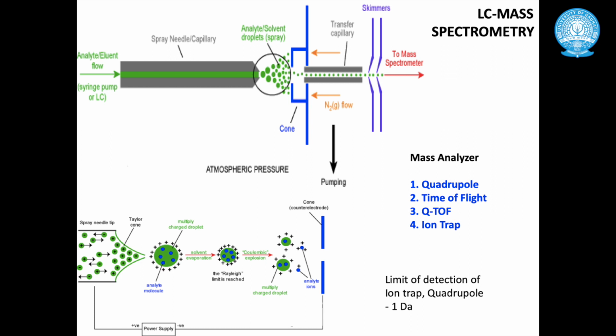However, after ionization, when the droplets break, the analytes, which are now charged, enter the transfer capillary, and then these ions are separated.